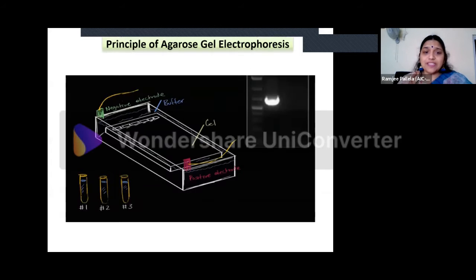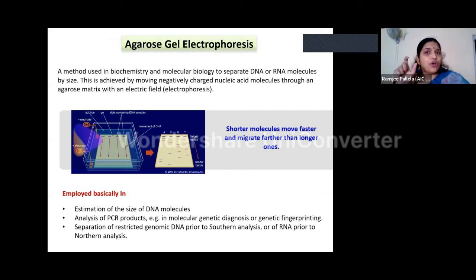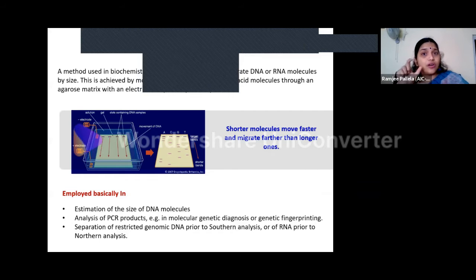So this is employed basically in the estimation of the size of DNA molecules, when you need to know the size of your particular amplicon. Generally, when you are only checking whether this particular gene is present or not in your DNA sample, it is all fine. But if you are actually doing molecular cloning and you need a precise size of your DNA to be inserted or extracted, in that case, you need to be very particular about the size of the amplicon or whatever amplification has happened.